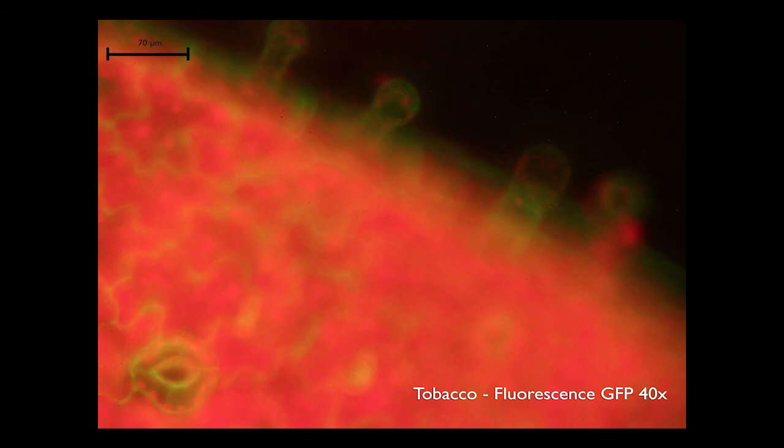These trichomes had the GFP marker, which fluoresced under the WB cube.